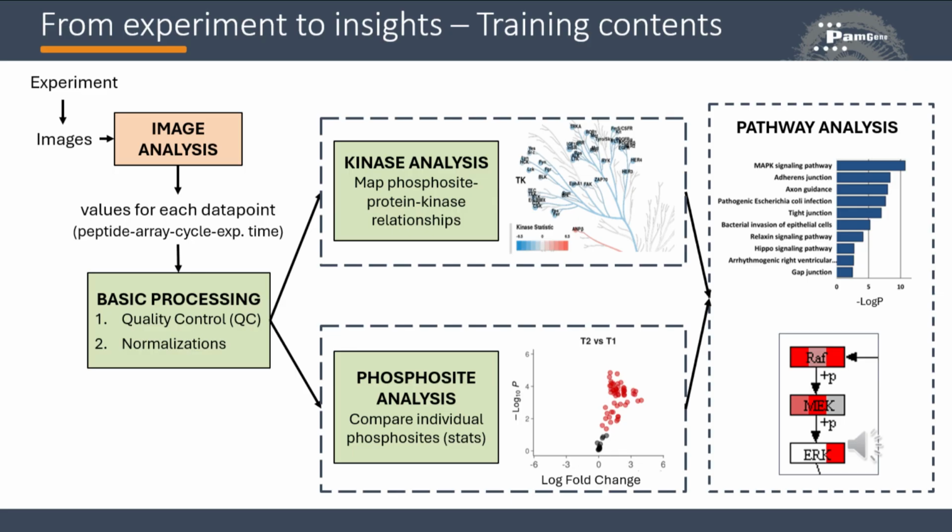This concludes the Upstream Kinase Analysis. You have learned about how the UKA predicts kinases and what the different scores tell about the significance of the predictions. Insight into signaling pathways and networks can be interesting. The next training part will provide guidelines on this topic.